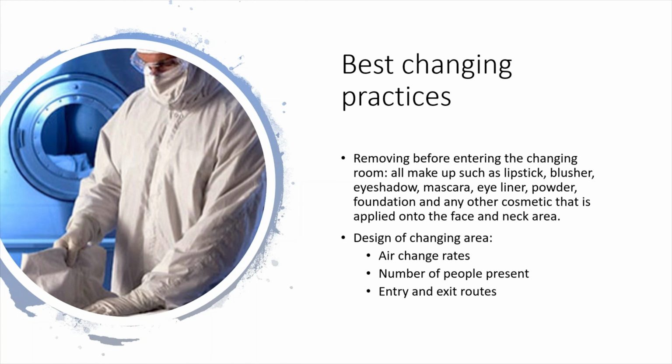So, to link back to what I said earlier, before you go near a changing room, you need to make sure that all makeup, such as lipstick, blusher, eyeshadow, mascara, eyeliner, powder, foundation, or any other cosmetic applied to the face or neck area, has been removed. You need to make sure that your gowning policy is in tune with other things that are likely to affect either particle generation or affect gown integrity.